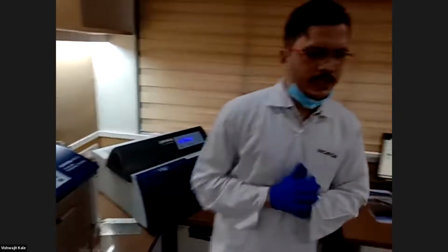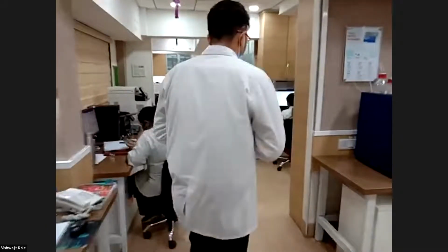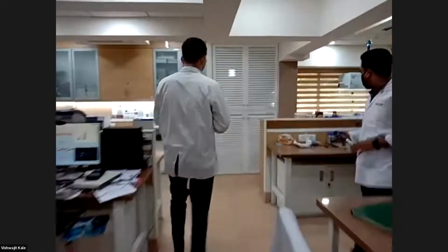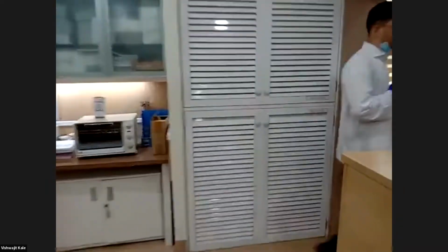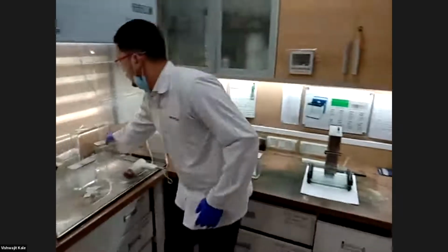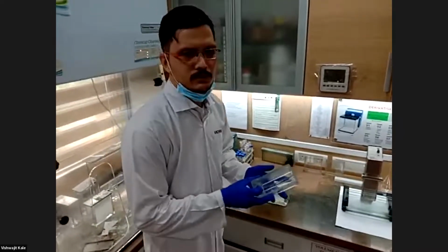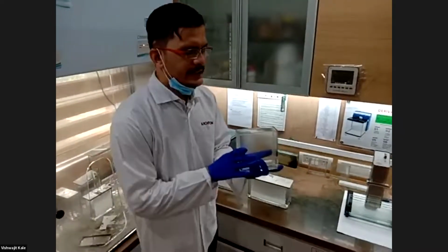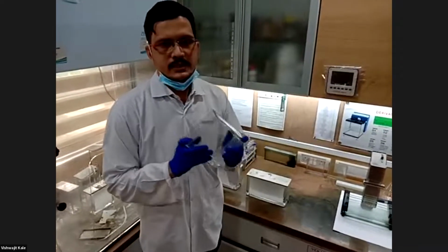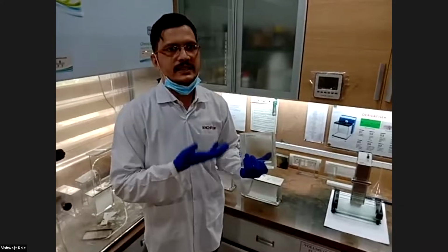So we have another option available with us. I will show you that manual development chambers we have kept in wet laboratory area. So these are CAMAG twin trough chambers, specially designed by CAMAG and made in single molded glass material. So universally you will get same dimensions and same material. So if you are using these twin trough chambers always, so you can generate reproducible results plate to plate, day to day, lab to lab.